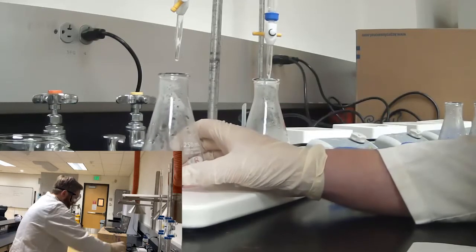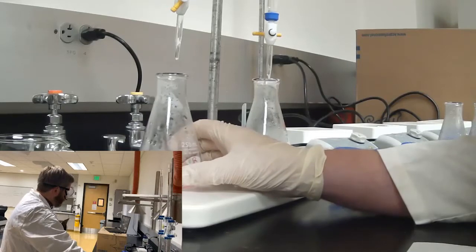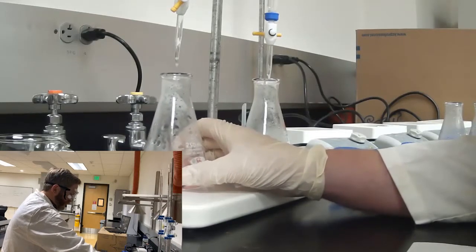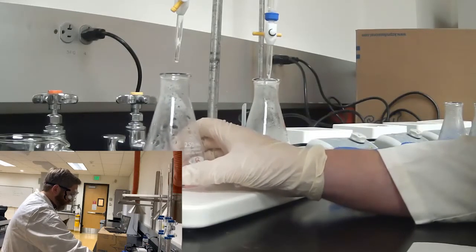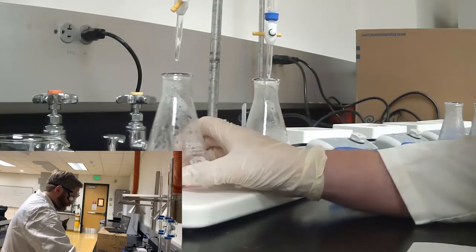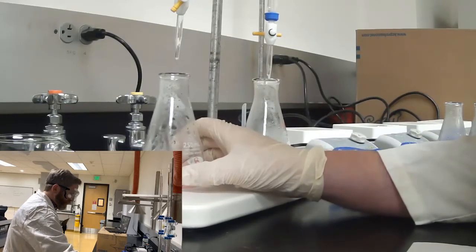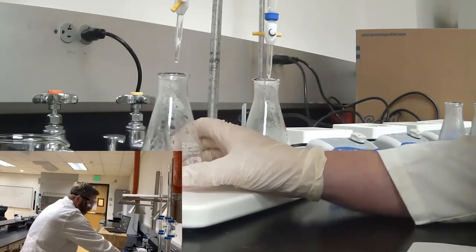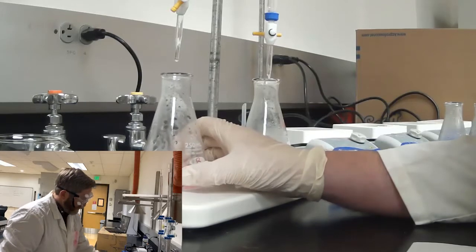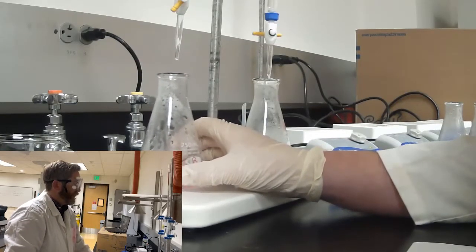A couple more comments on the burettes. Once we have filled it, we want to make sure we turn the stopcock here and let a little bit pass through to make sure there's no air bubbles here inside the bottom of the chamber. So I've already filled them and then drained them a little bit, so there's a little bit of liquid down in here that I collected under the bottom. So we'll put these under here and get them ready.